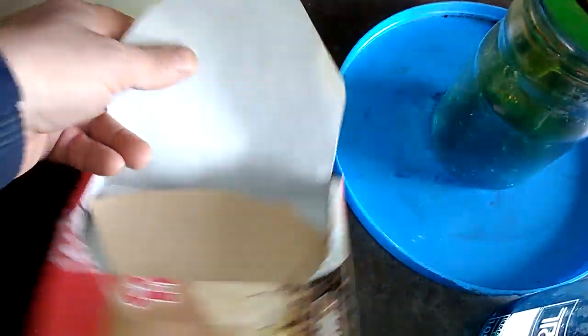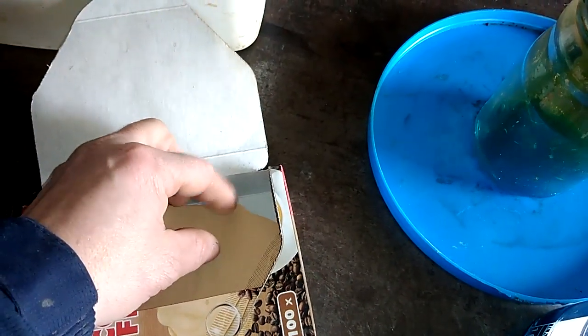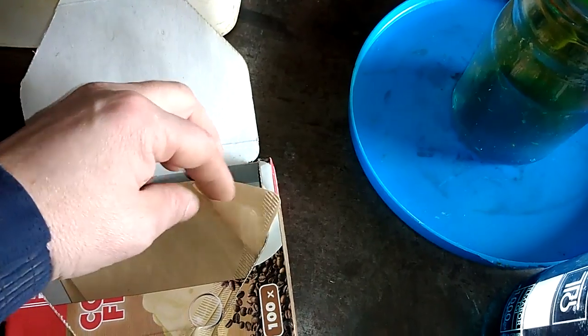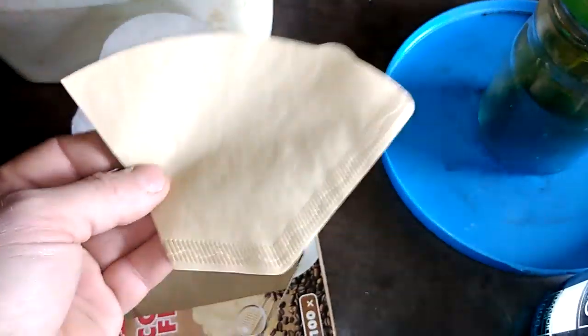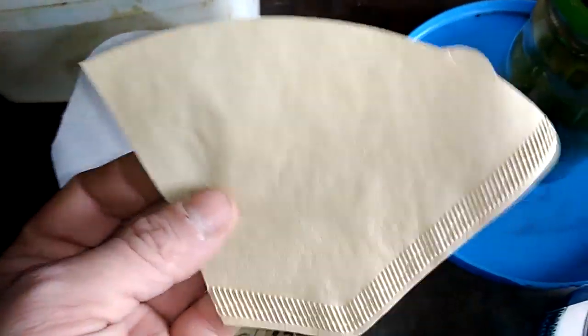This is the filter I use — it's a normal coffee filter size 2. It's better when it's size 4, but right now I cannot go to the store because of that stupid virus. I need to use what I have. So this is just a normal coffee filter for solution filtering.